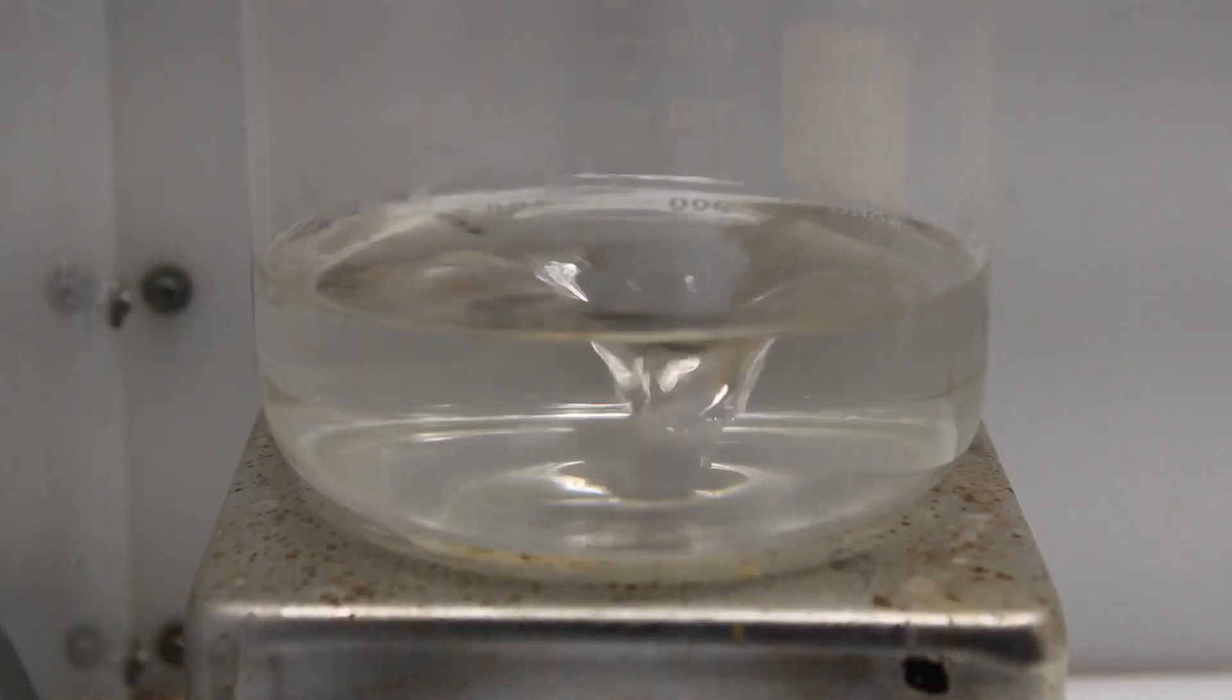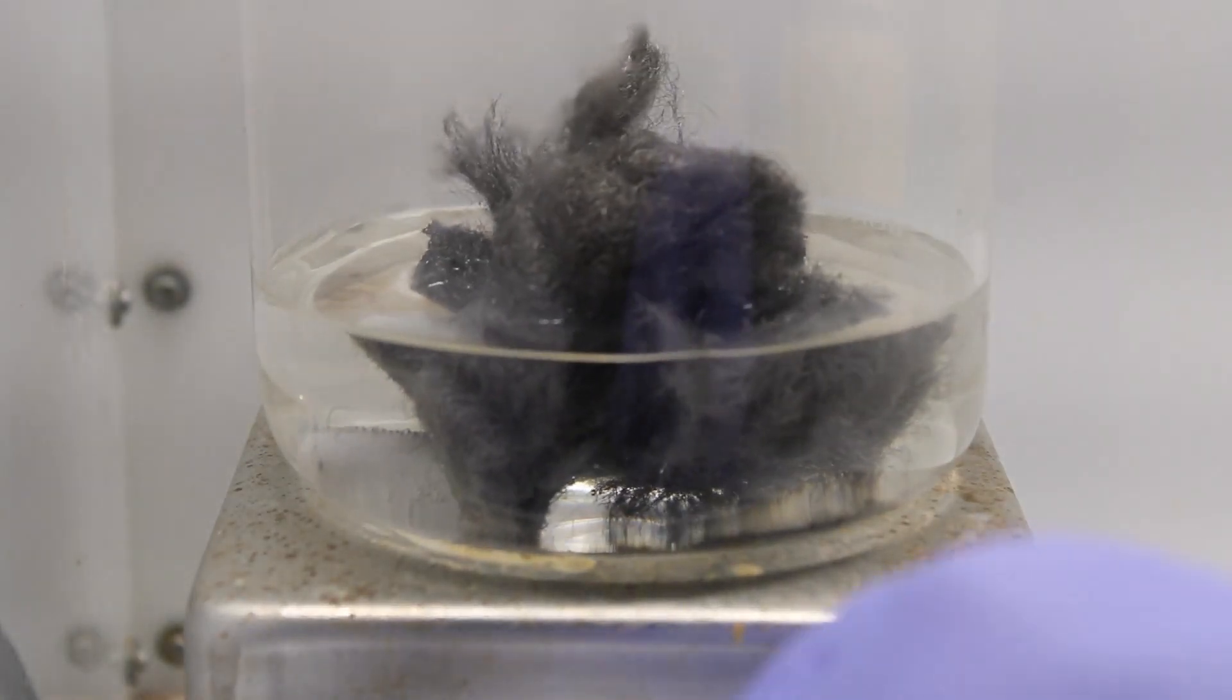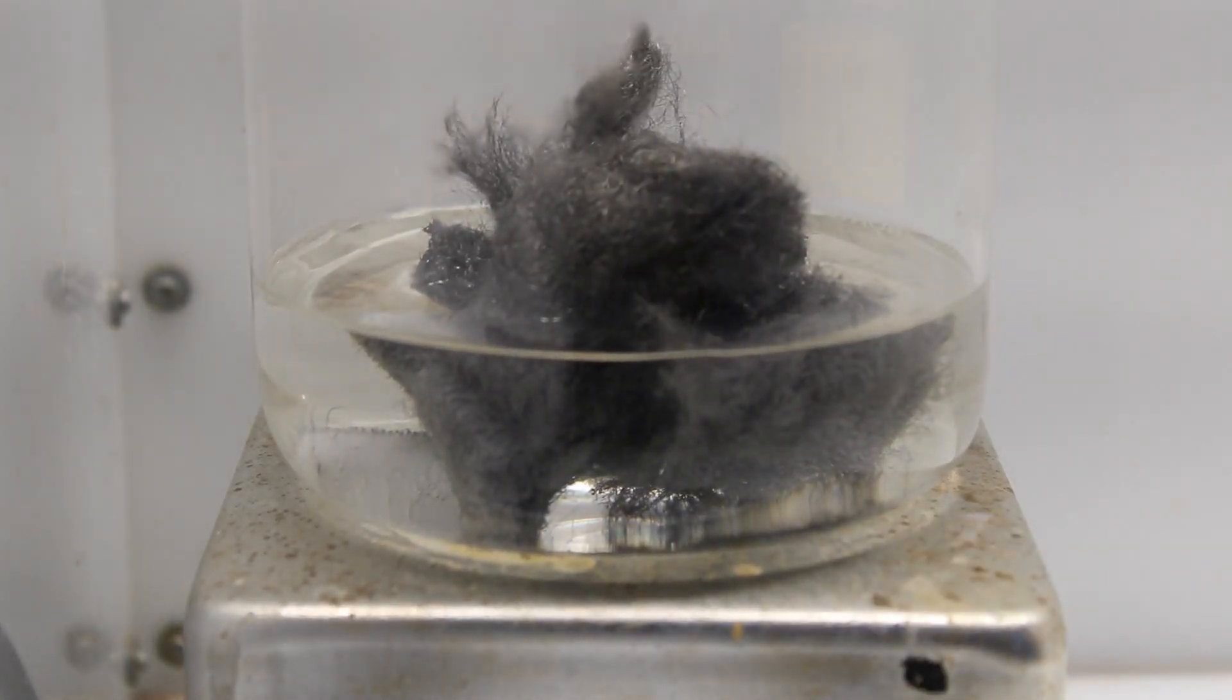Then, 0.5 mol of iron wool, or 27.92 grams, are added gradually with heating to speed things up.